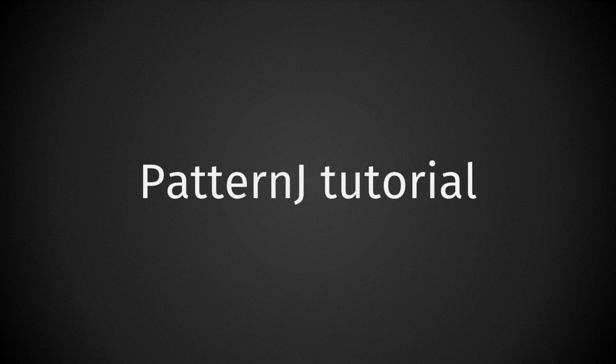In this short video, you will learn how to install and use PatternJ. PatternJ is a user-friendly toolset for ImageJ and Fiji. It will allow you to automatically analyze regular patterns. Such patterns are a very common type of organization in animals.